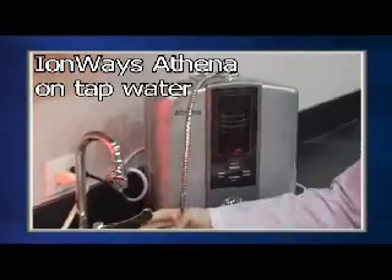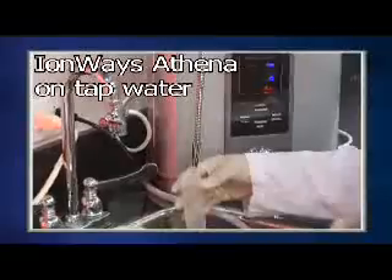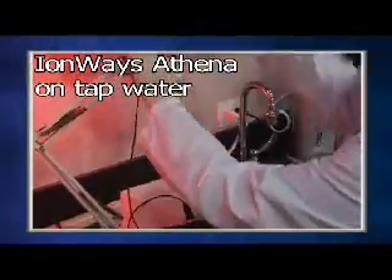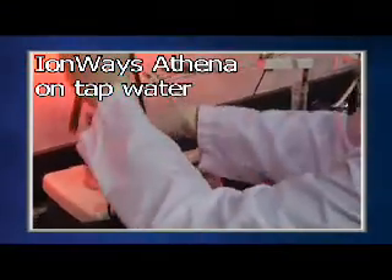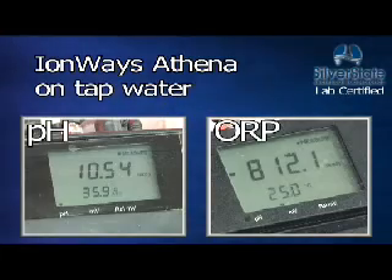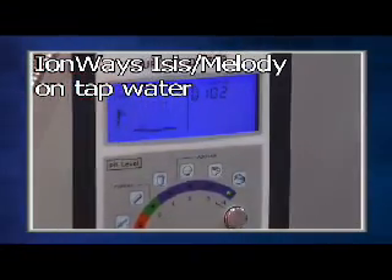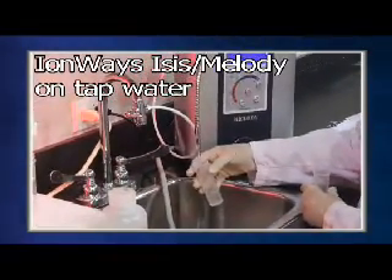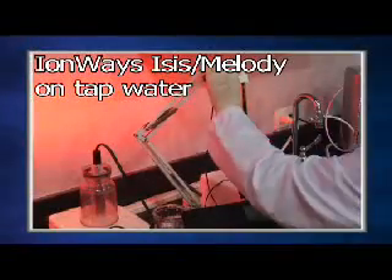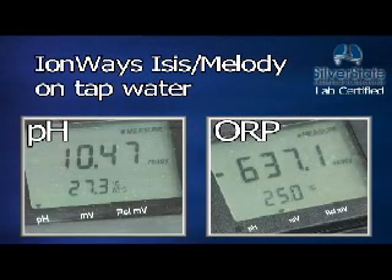The first ionizer tested is the Ion-Ways Athena. The Athena's high alkaline on the tested water supply is 10.54 pH with an ORP of minus 812. Next is the Ion-Ways Isis. The Isis has a high alkaline pH of 10.47 and an ORP of minus 637.1.